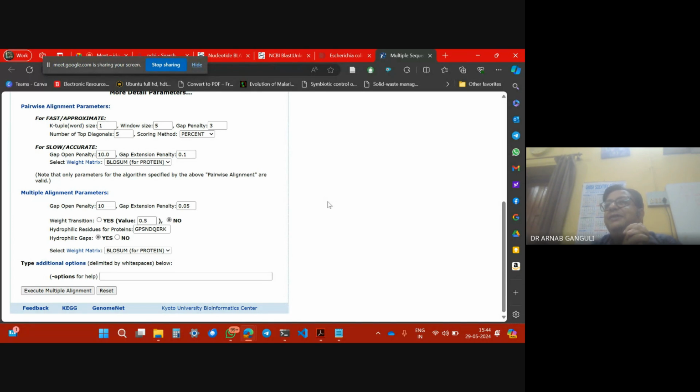Today you have done something with 100. Maybe 1 month later, तुम्हारा बॉस बोला कि और एक बार कर लो तो भाई ये यही तो आ रहा है. छापने के पहले, गलत छापने के पहले थोड़ा सा वेरीफाई कर लेते हैं. So what to do now? आई गो इसके बीच में within these 30 days और भी 150 का सीक्वेंस कोई सबमिट कर दिया. Now if you do this, it's going to compare with the new 150 sequences. Your values which you have got.